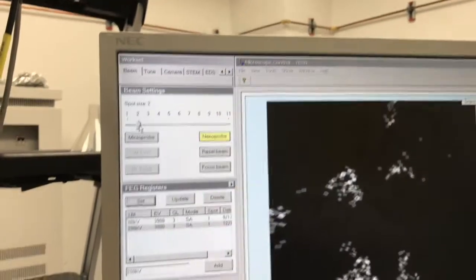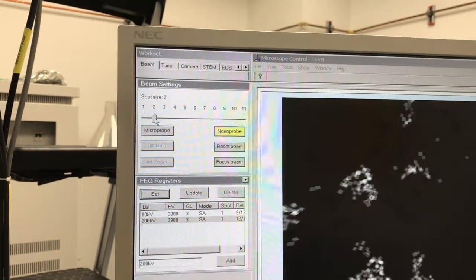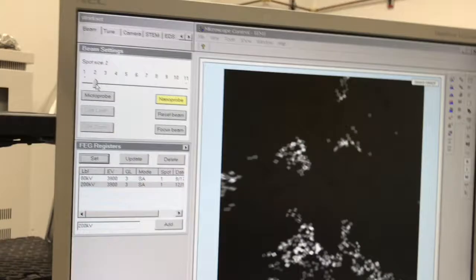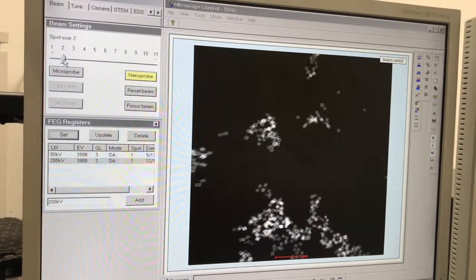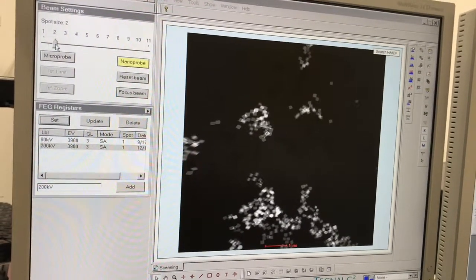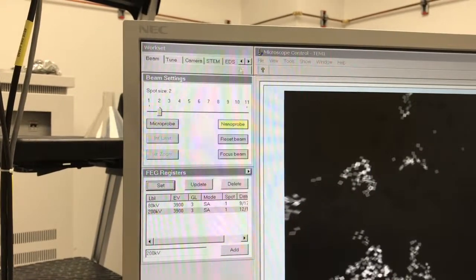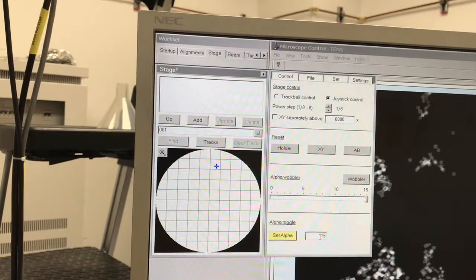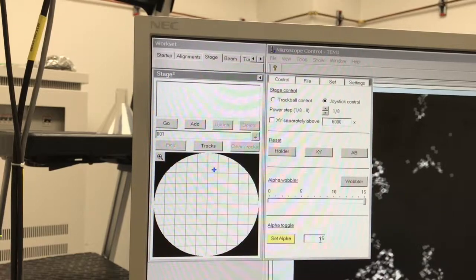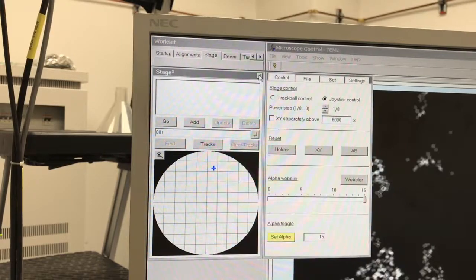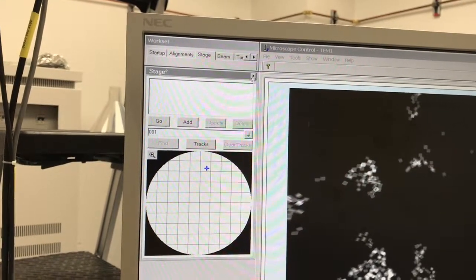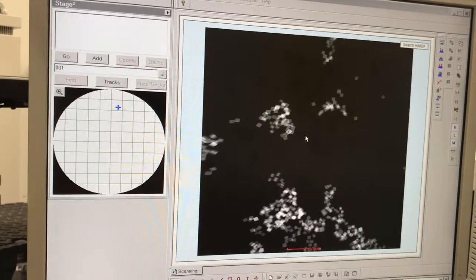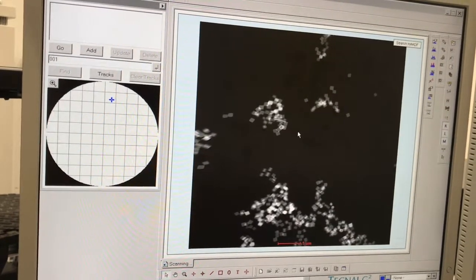We have the double tilt holder in, so we don't have to make any adjustments to the stage tilt. We're at zero degrees tilt right now. Because these are core-shell particles we do want the particles oriented a certain way to get an accurate spectrum image. If we were using the single tilt holder — as discussed in the EDS demo — you'd come to the stage tab and set the alpha tilt to 15 degrees to give clear line of sight to your EDS detector. We're not going to do that because we have the double tilt holder in, and for this core-shell arrangement having the holder untilted is actually a necessity to get the spectrum imaging we want.